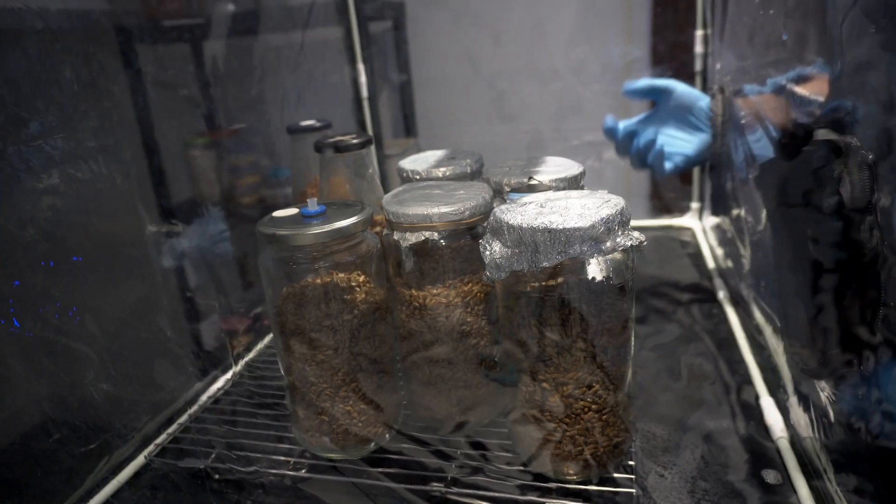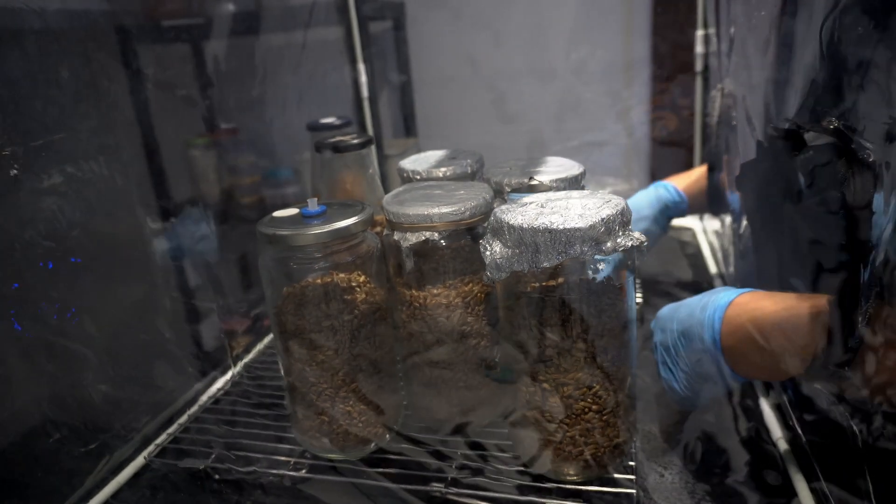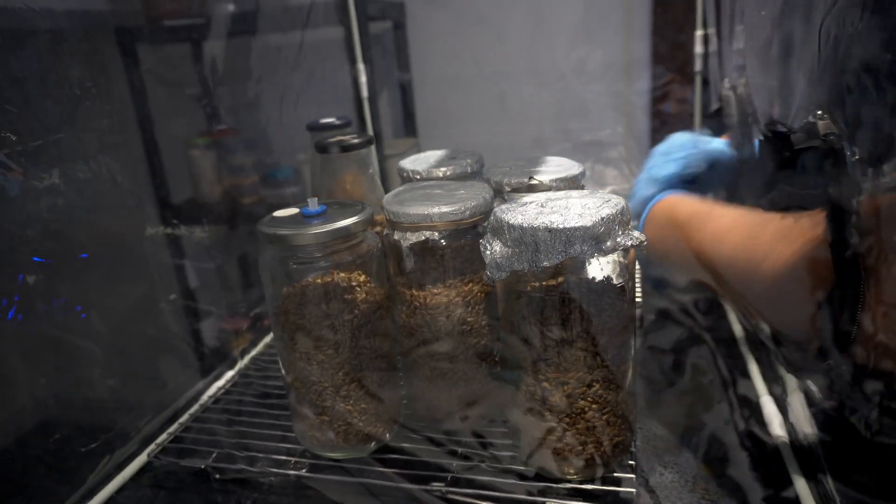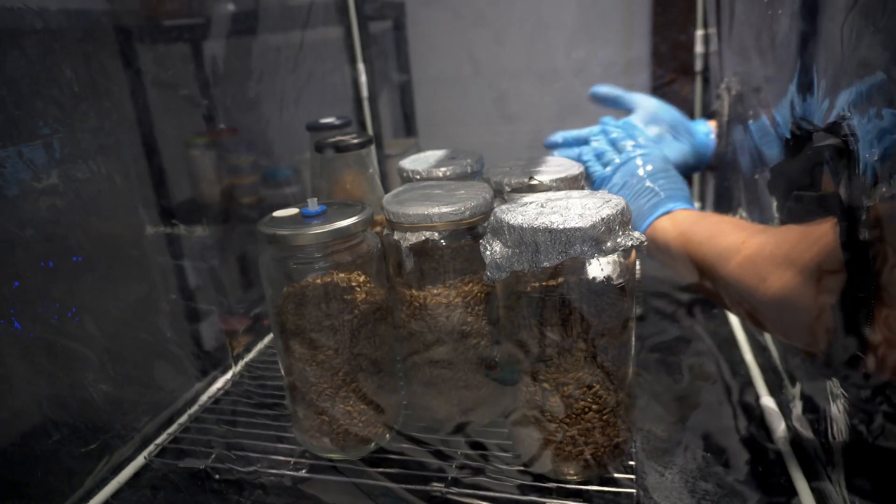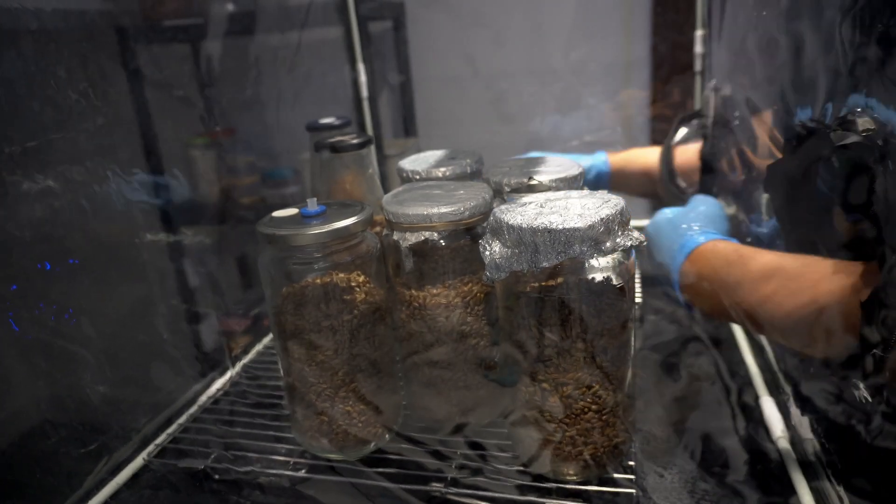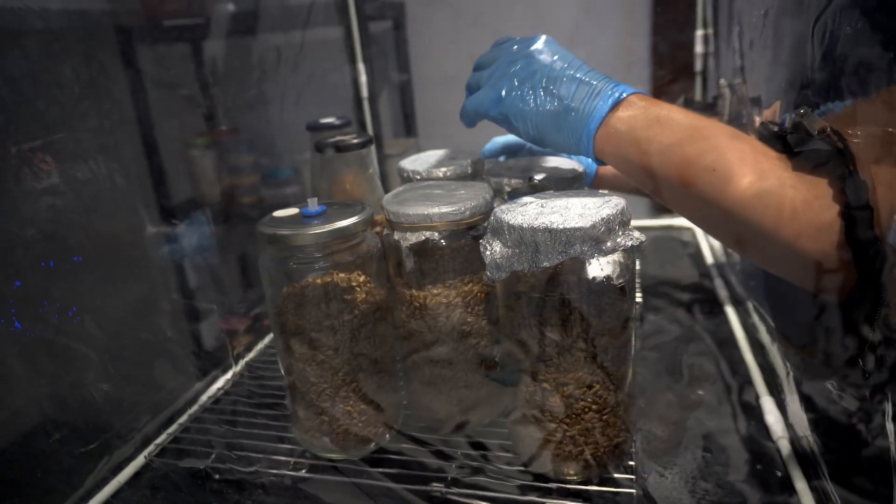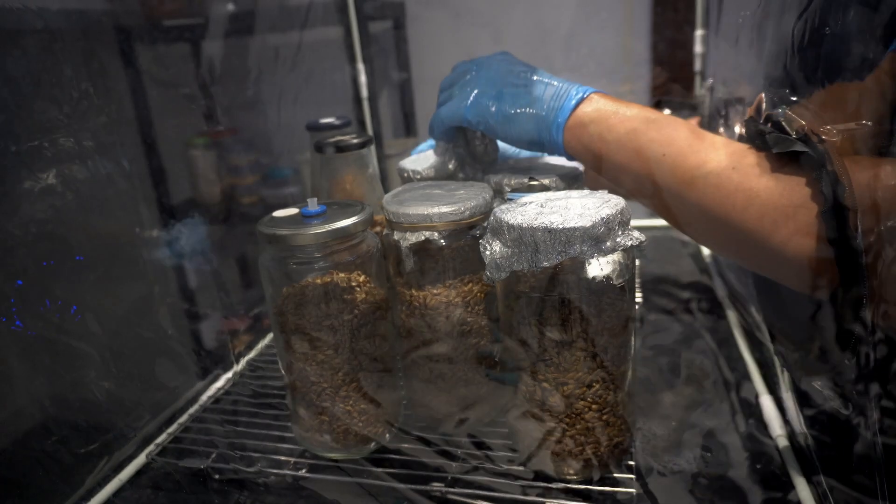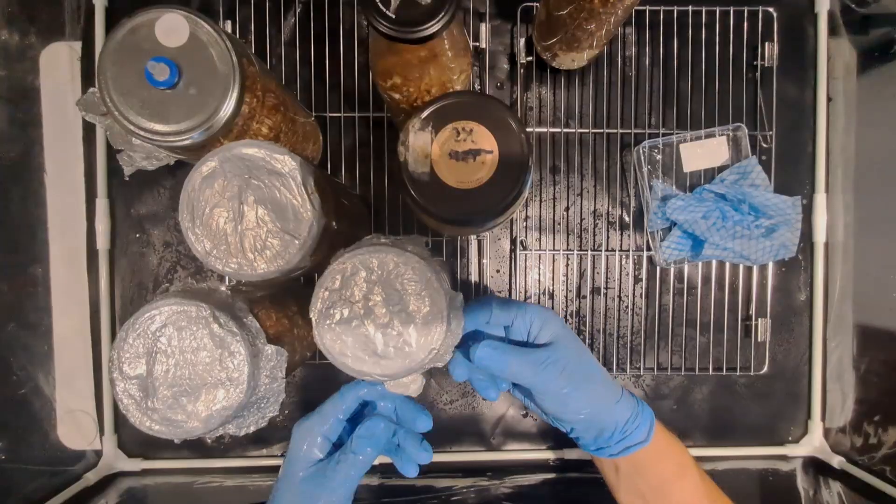You want to wipe your hands down with the 70% alcohol solution before you start working inside the still air box and it's probably a good idea to allow your hands to dry and the alcohol on the outside of the jars to dry before you start picking up jars.